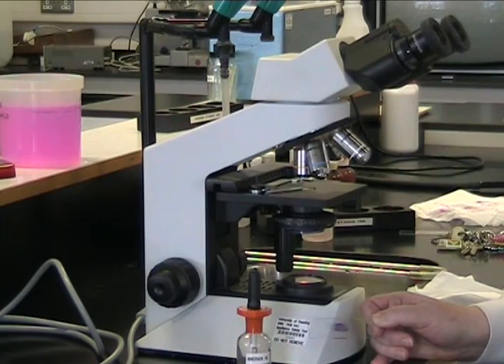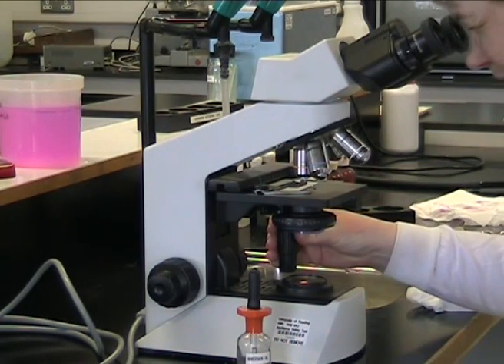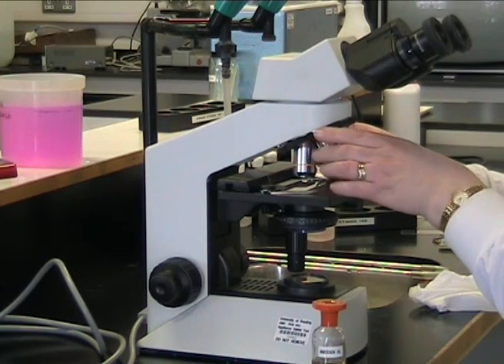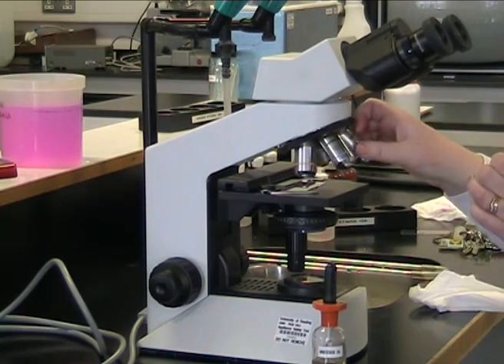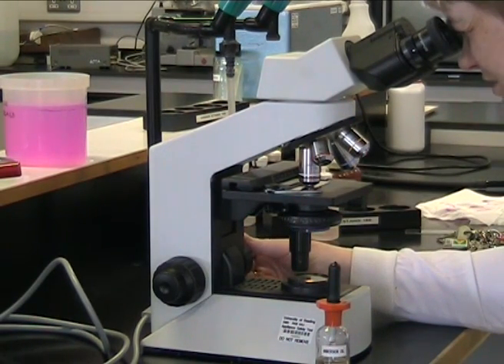We're now going to look at our prepared slide under the microscope. This involves the use of the oil immersion lens. First of all, we place it under the x10 objective so we can view the smear under low magnification. We now place a drop of immersion oil onto the stained area of the slide. Then pass the oil immersion objective into the oil. Look down the microscope and using the fine focus adjustment, adjust up and down to get your slide clearly into focus.